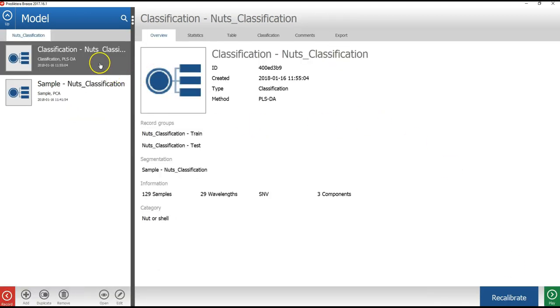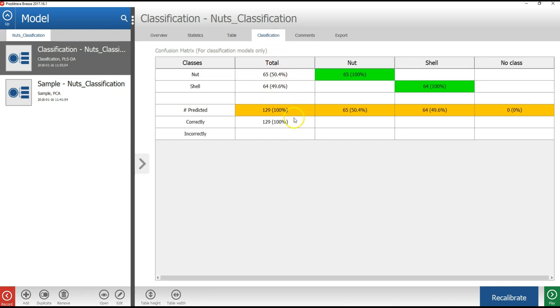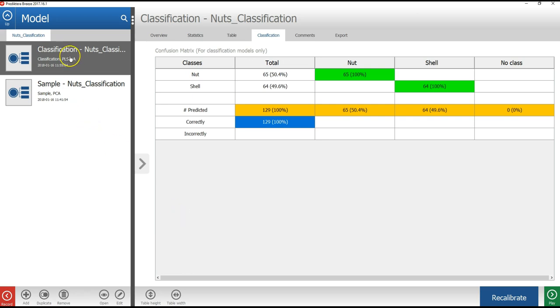The classification model has now been saved, as you can see in the menu on the left. With this model selected, I will press the classification tab to see how many samples were correctly classified. In this case, we can see that all the nut or shell samples were correctly classified. In the next step, I will make an analysis workflow that will use this classification model to analyze the test image with unknown samples.